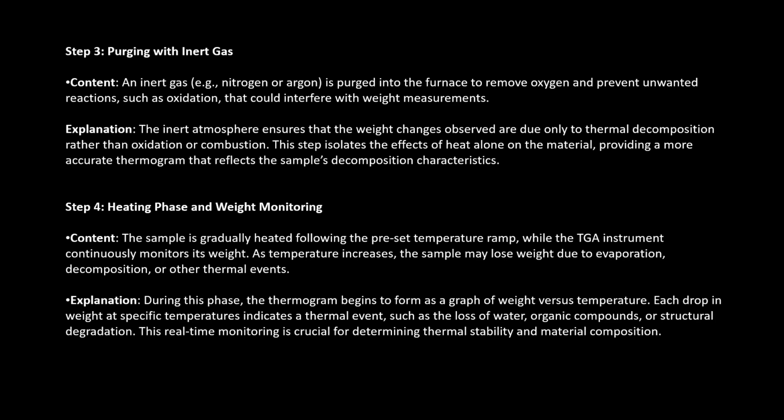Fourth step is heating and weight tracking. The sample is heated gradually according to a programmed temperature profile while the TGA instrument continuously measures the weight.